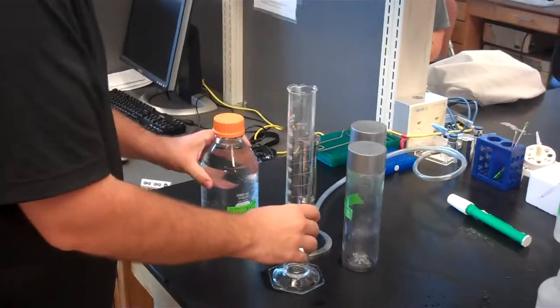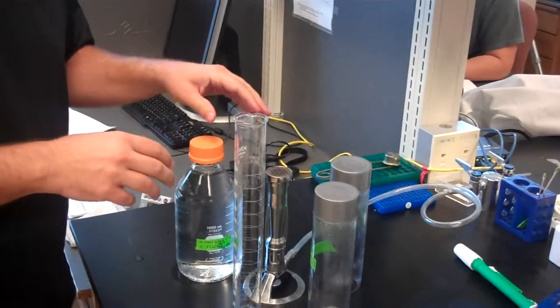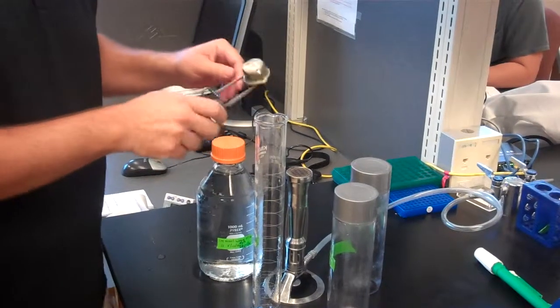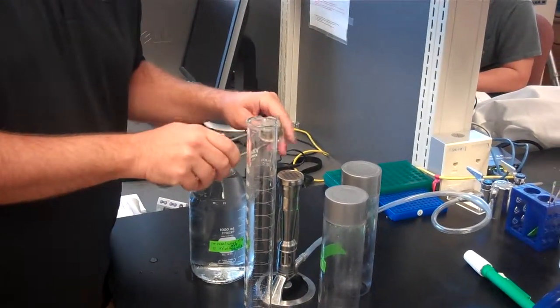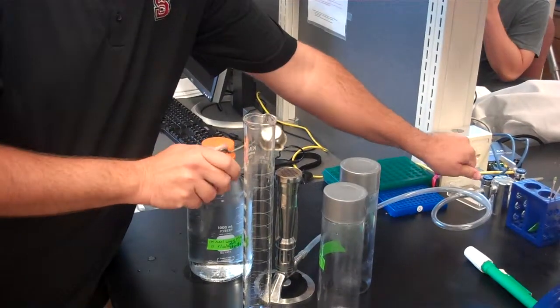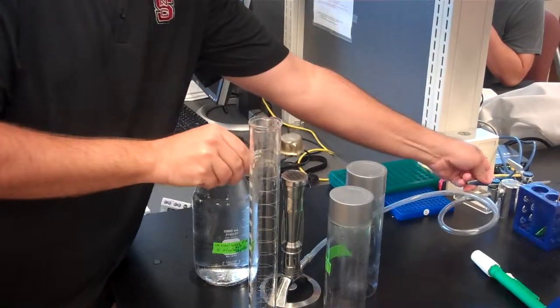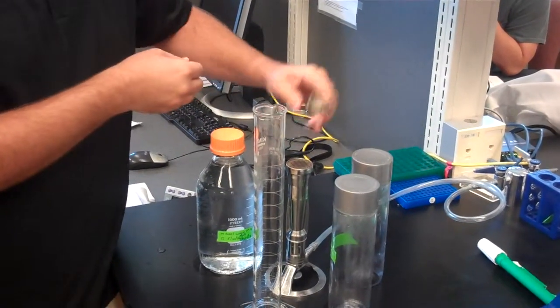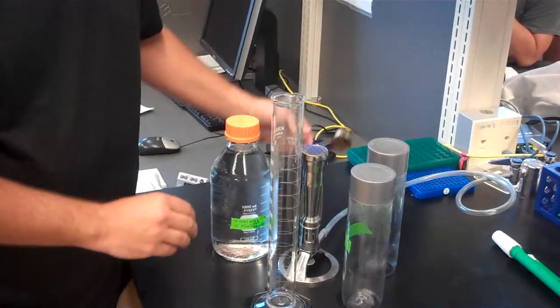Now that I've got everything situated the way that I like it, I can turn the gas on and light the burner. So what I'm going to do is hold the igniter here ready so that when I turn the gas on, I'm not letting the gas run. Eventually. There it goes.